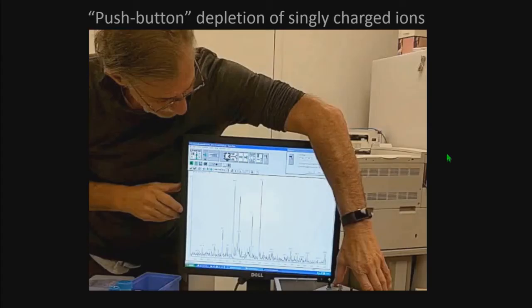Here's an experiment we made with Brian Chait, who is starring in a movie that demonstrates how easy it is to switch between two modes, depleting and not depleting. Please pay attention to this group of peaks. It's again these 5 peaks. This is charge state +2, +4, +1, +3, and +5.